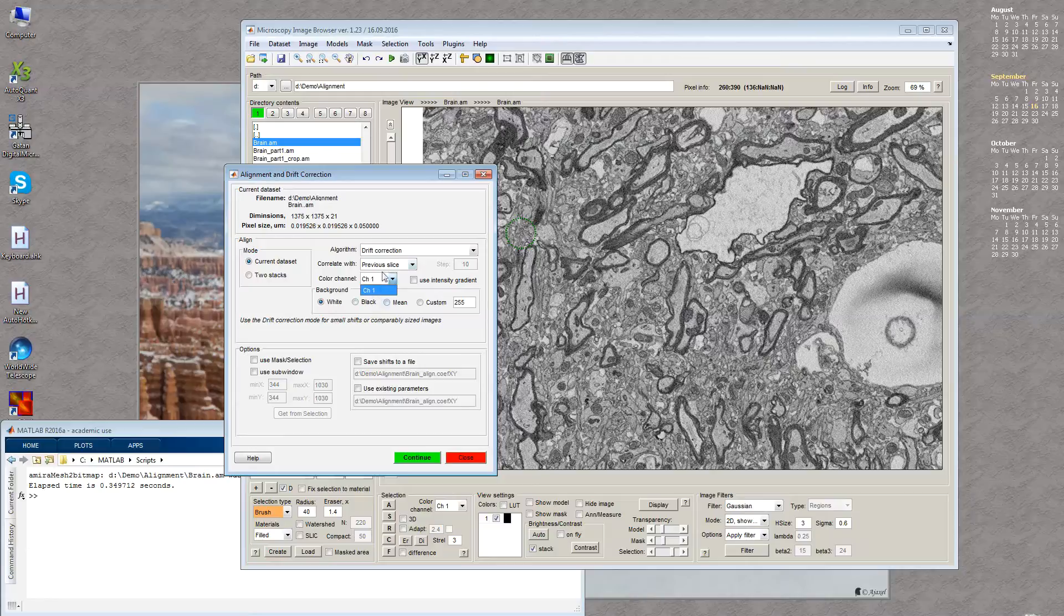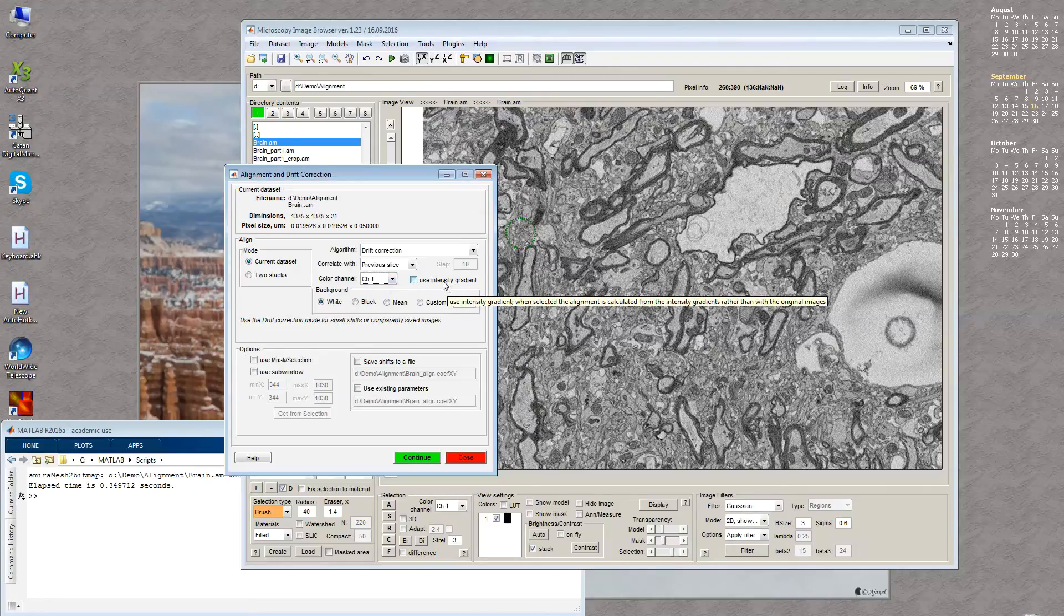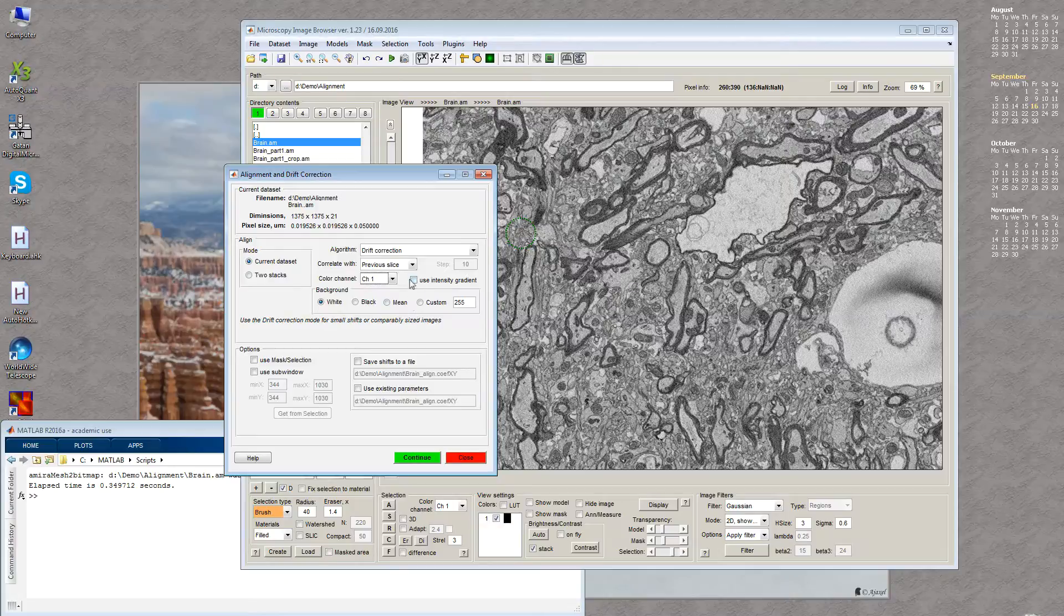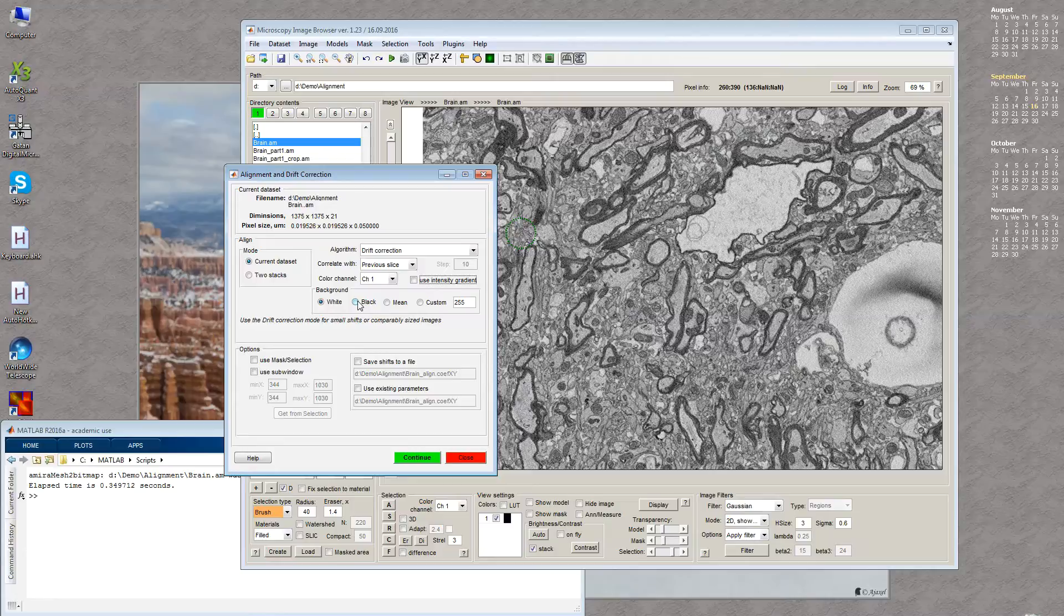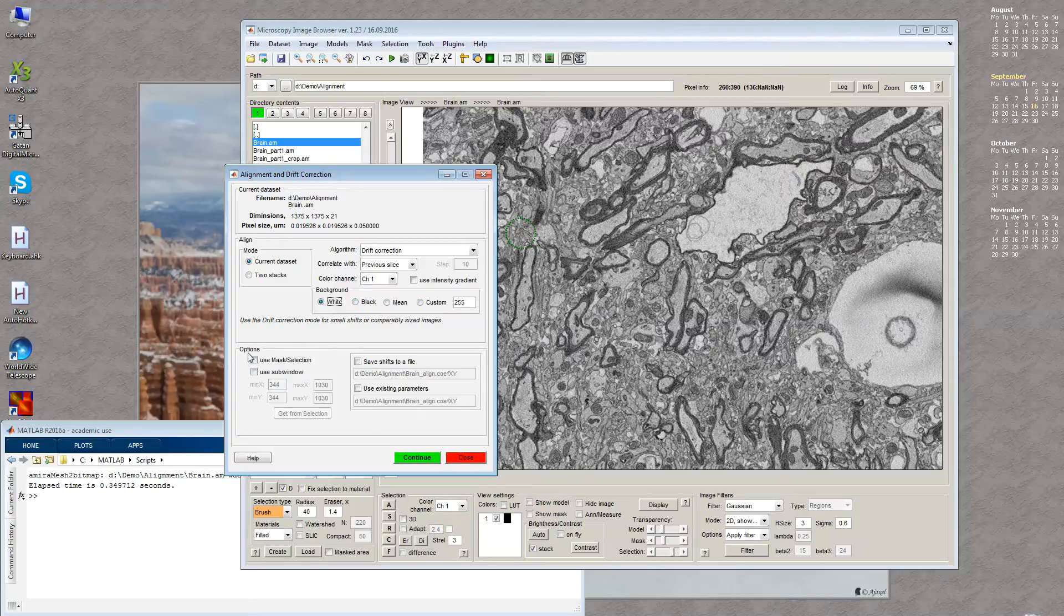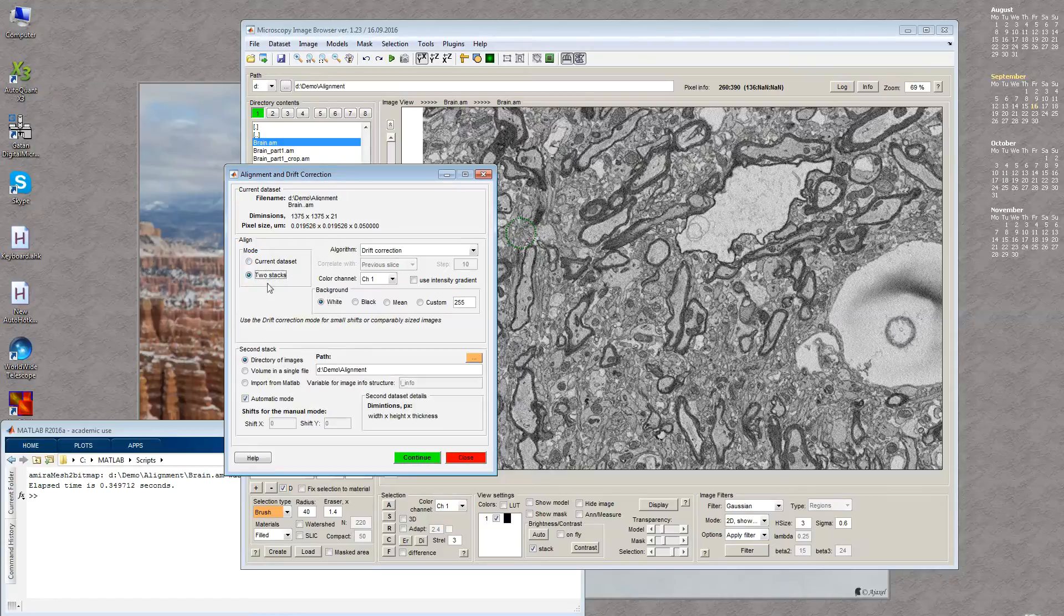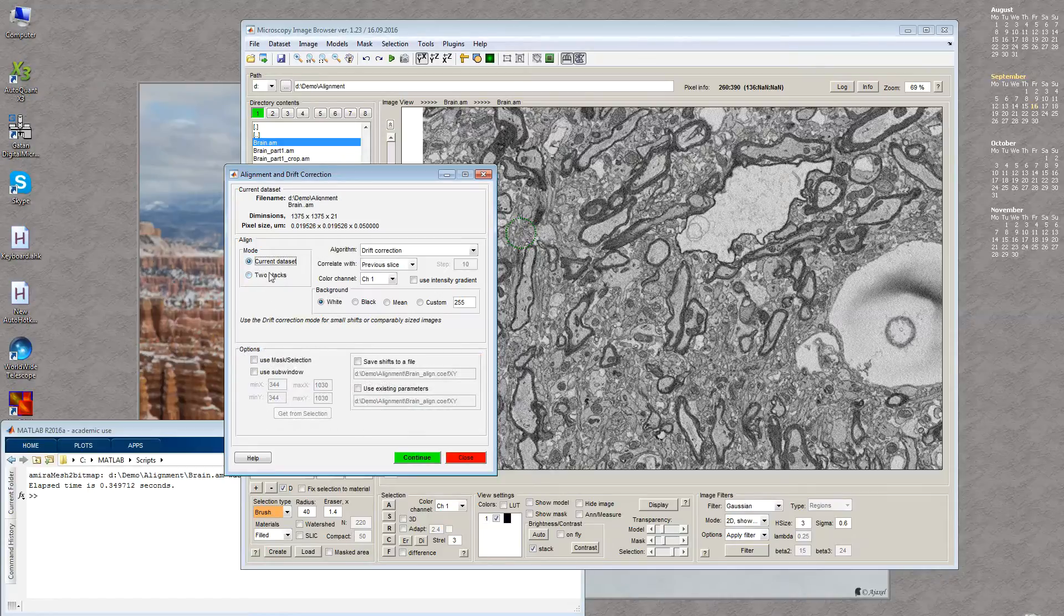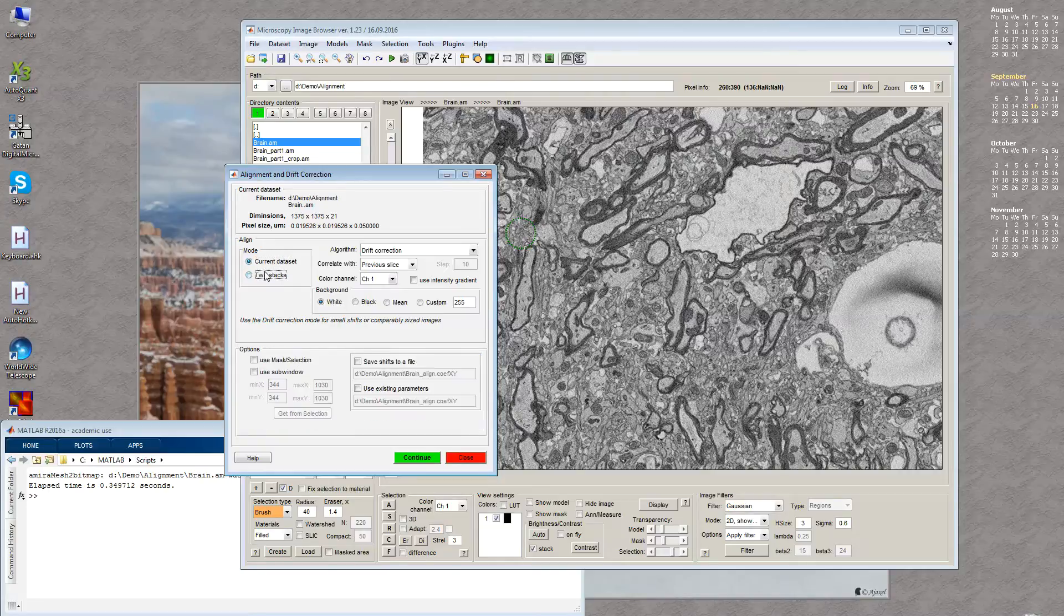If there are multiple color channels, we can select which to use for alignment. Sometimes we get better results using intensity gradient instead of images by clicking this checkbox. During alignment, the empty pixels that appear can be filled with white, black, average value, or any custom number. The third panel provides additional options that change depending on the selected mode.